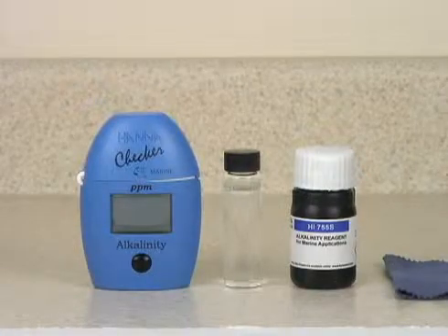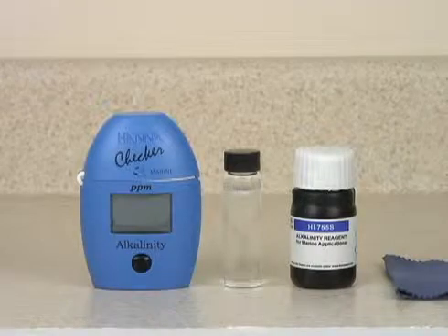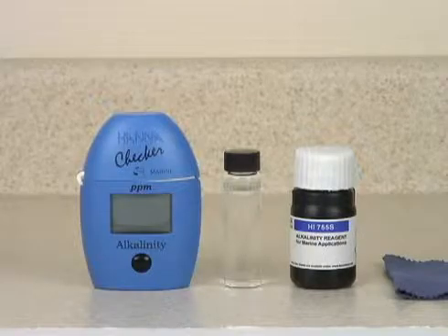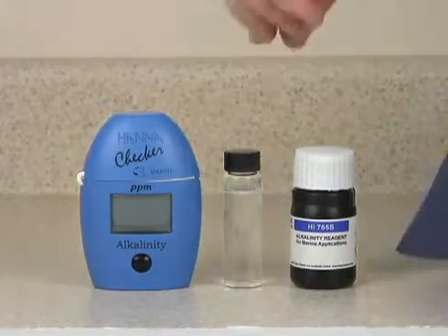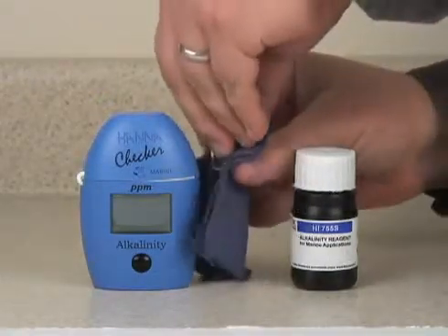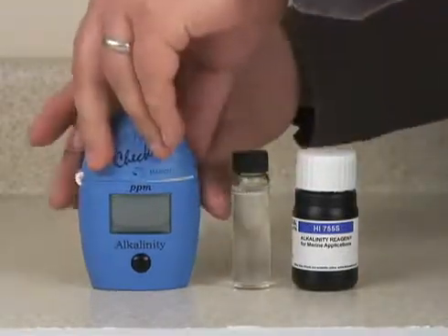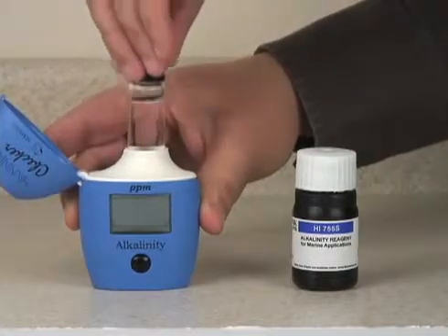This is the Hanna Instruments HI755 Marine Alkalinity Checker. The first step is to fill the glass cuvette to the 10-milliliter line with your sample. Wipe the cuvette of any fingerprints and place it into the instrument.